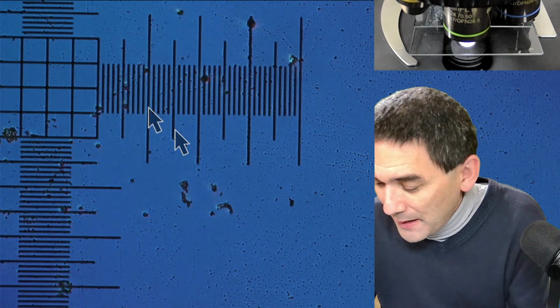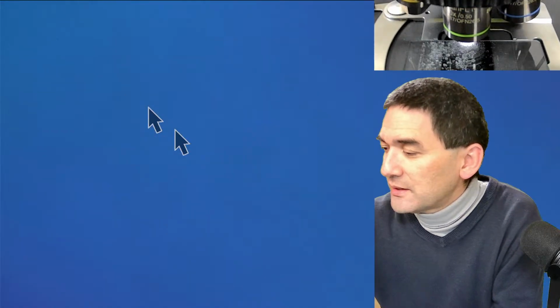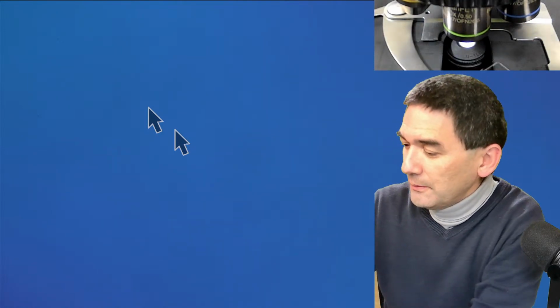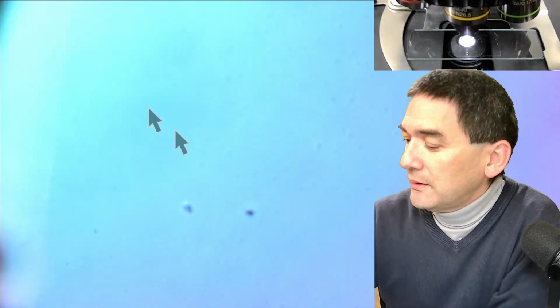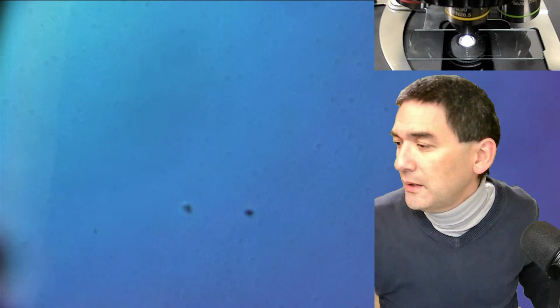Let's go quickly to something else that I would like to show you. Let's take this out, let's simply remove the beard again, and I would like to show you now some of my hair, which I also made into a permanent slide. I prepared this because it's simply faster this way. I can remove the arrows again here. Let's take them away. And here it is again.